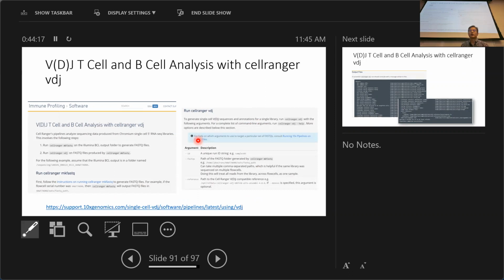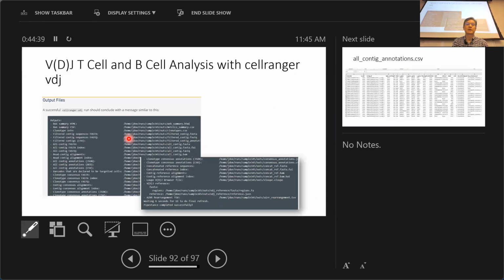Then you put your raw sequence in Cell Ranger. This Cell Ranger is a version particularly designed for VDJ analysis. It will read out the structure, the type, and subtypes of VDJ combinations. Those are the pipeline and some of the output specifically for VDJ analysis.